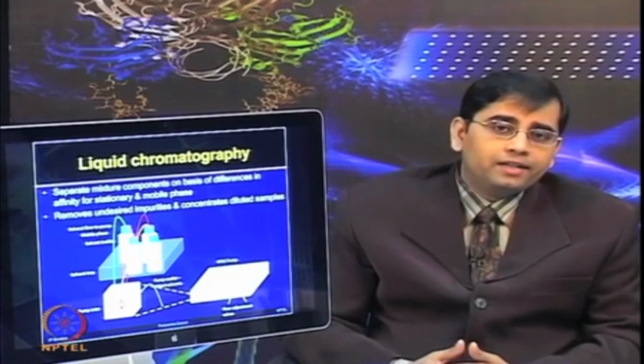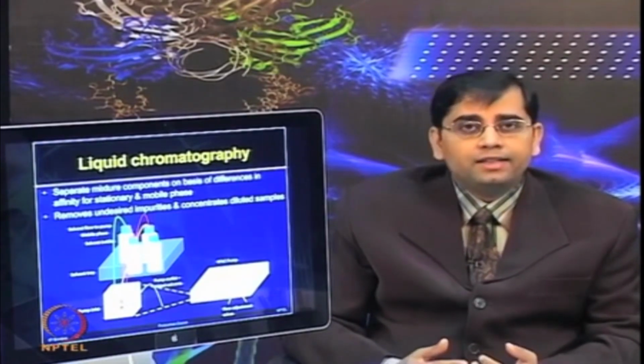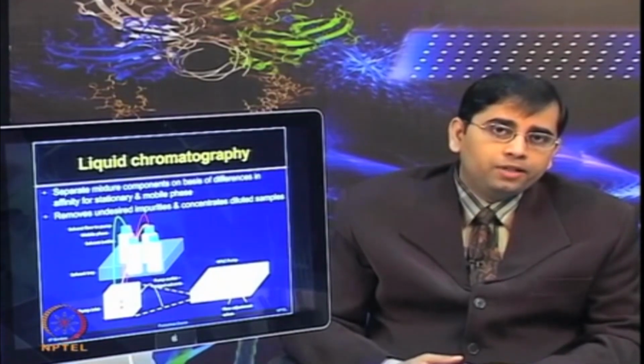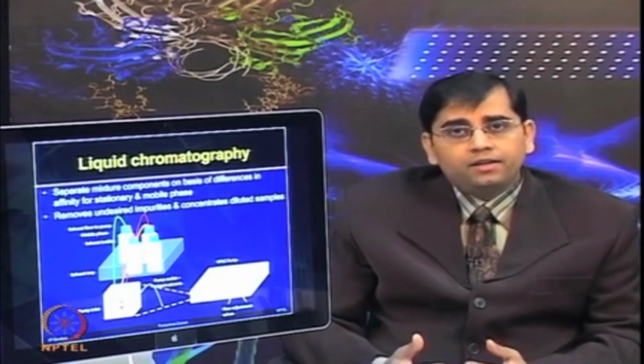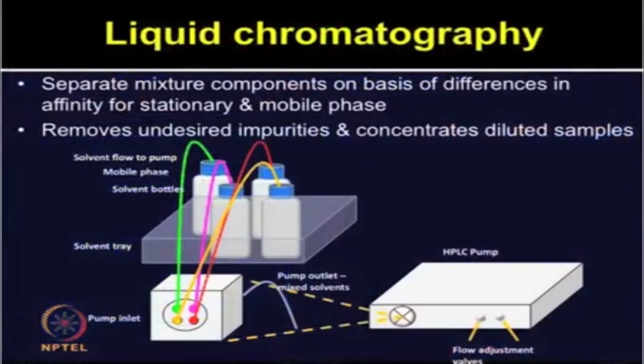It also concentrates the diluted samples and therefore, it increases the detection sensitivity for low level proteins when you are applying different types of proteomic technologies. It is mostly used for separating peptide mixtures.